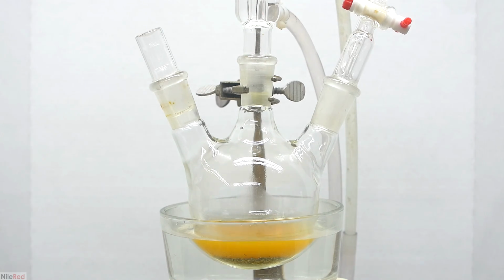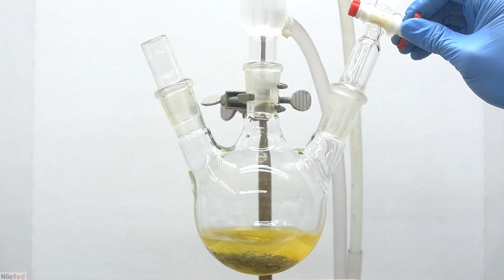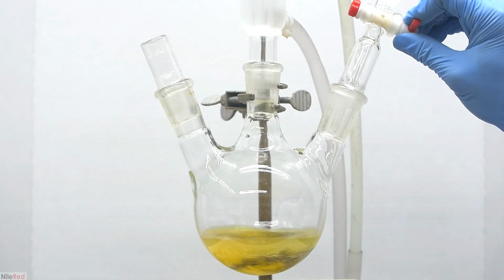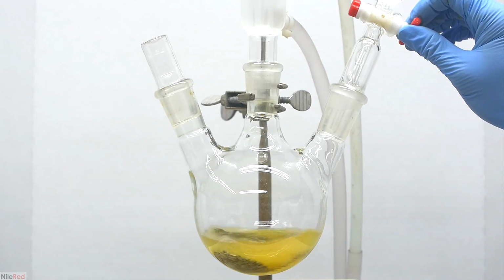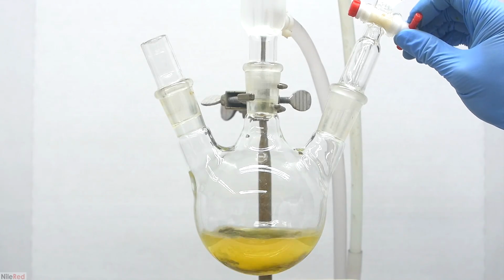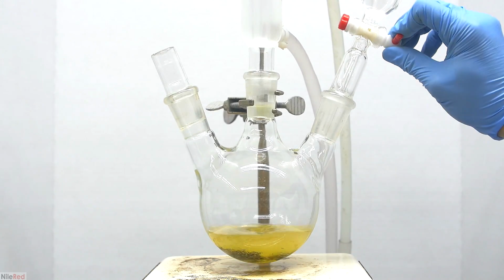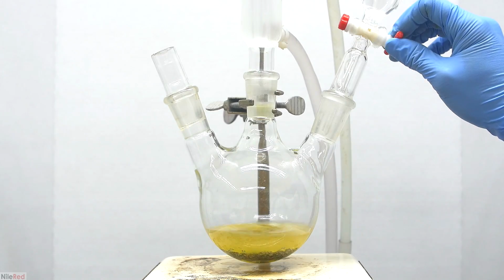Once we've brought the ether to a steady boil, I take away the hot water bath, and we're ready to start adding the 1-bromopentane. I open the stopcock, and I start to add the 1-bromopentane slowly. If the 1-bromopentane reacts, it's an exothermic reaction and heat is generated, so we should start to boil the diethyl ether. As I add more 1-bromopentane though, it really doesn't seem like very much is happening.